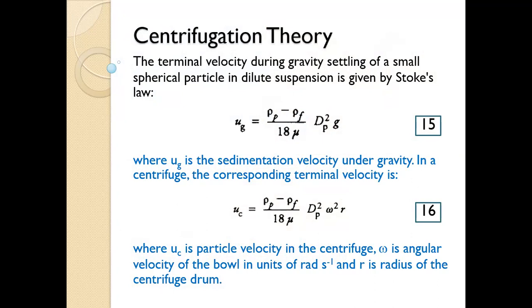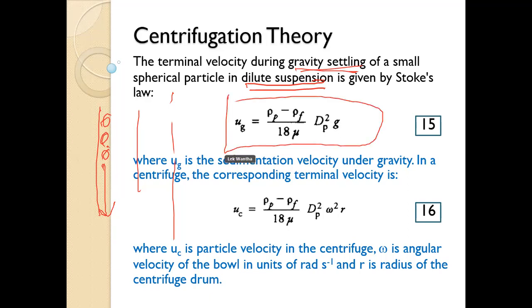The next topic is the theory of centrifugation. As I talked about previously, we have solid in a liquid suspension, and the solid will settle down. We will also talk about particle flow in the liquid due to gravity settling. If it is a dilute system, where the amount of solid is low compared to the liquid, a dilute suspension, we can calculate the sedimentation velocity.